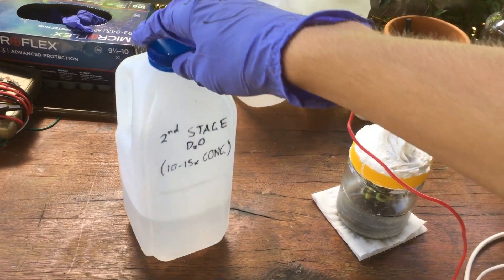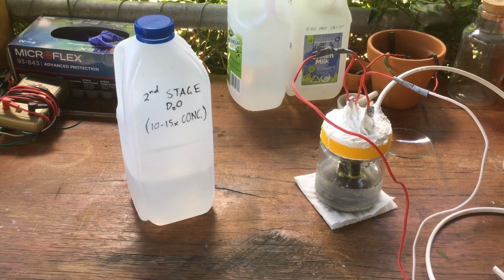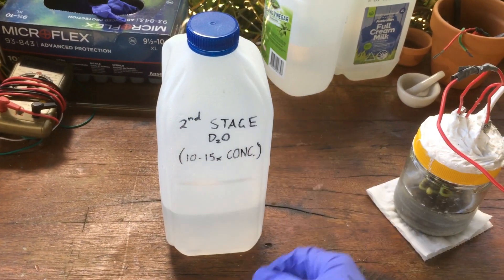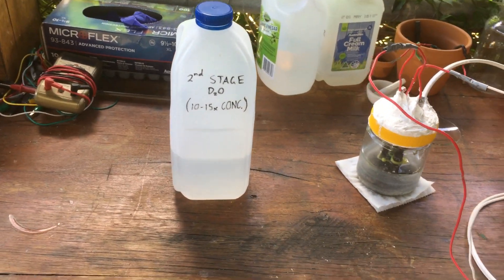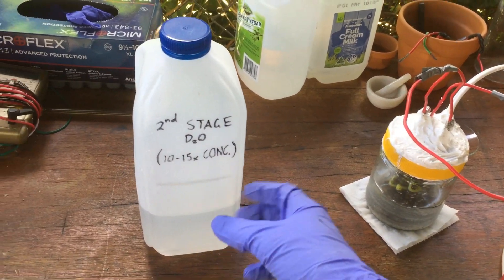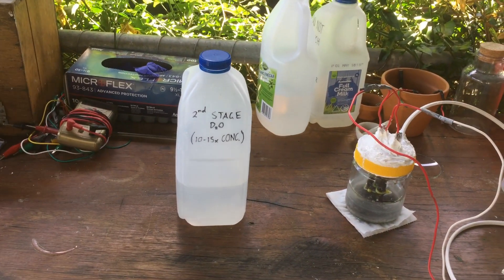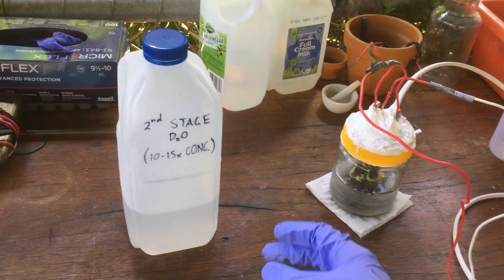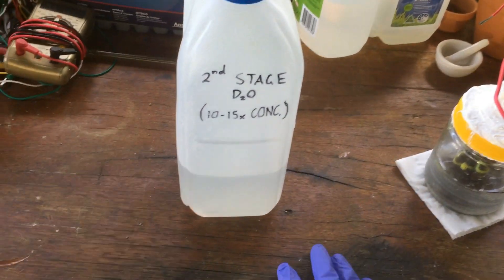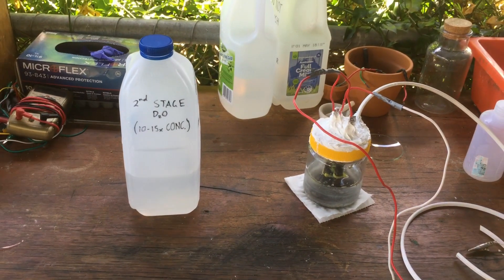What we've got so far is — right now it's near the end of January, the video probably won't go up for a fair while — but at this stage we've got around 800 millilitres of 10 to 15 times the regular concentration of deuterium. I've just made a little bit more which I'll add to that, and we have about a litre of that, including this.